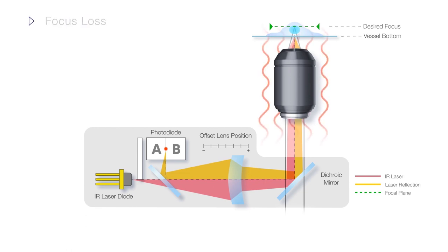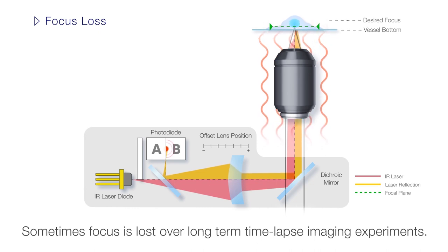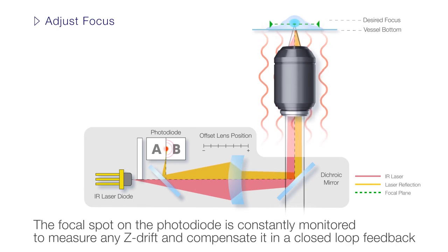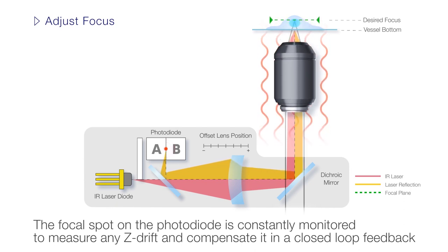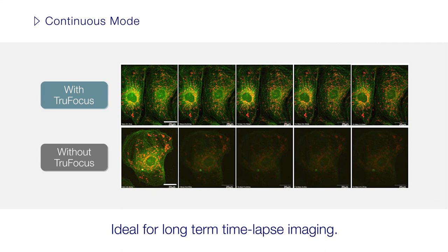In the past, microscopes had to be manually refocused when the focus was lost during long-term time-lapse imaging experiments. Now, the TrueFocus unit will constantly monitor the focal spot on the photodiode to detect and compensate for any Z-Drift. By automatically adjusting the Z-Drive, the system ensures continuous focus throughout extended time-lapse experiments. The time-lapse images acquired using the TrueFocus unit are consistently clear and bright, and always in focus.